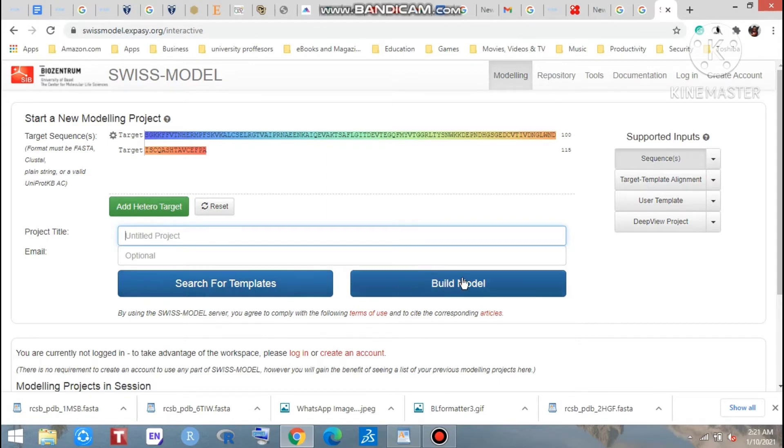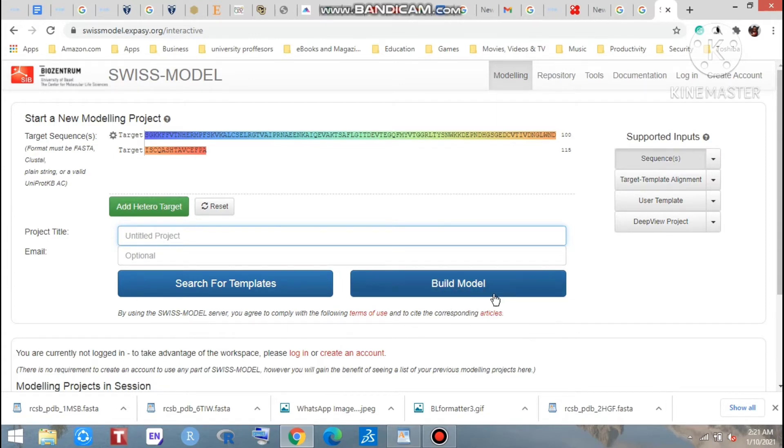So here are two options: one is search for templates and there is build model. If you want to click these, you can get the 3D structure, but I will suggest you first not to click here. I suggest you to go through this process - search for templates.